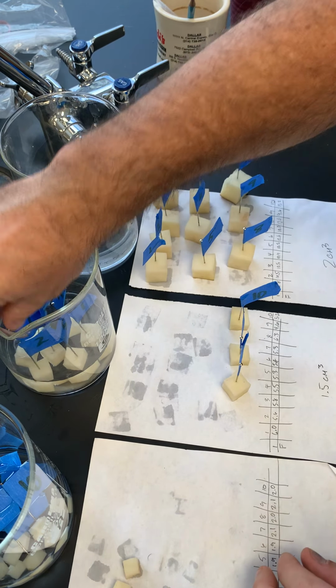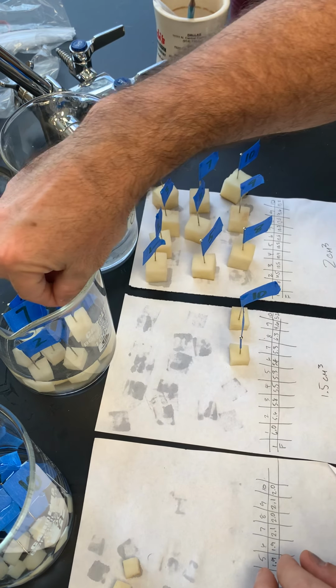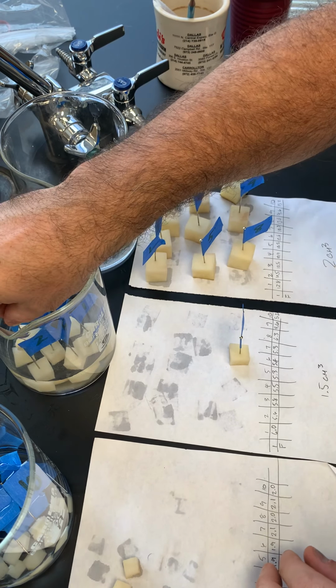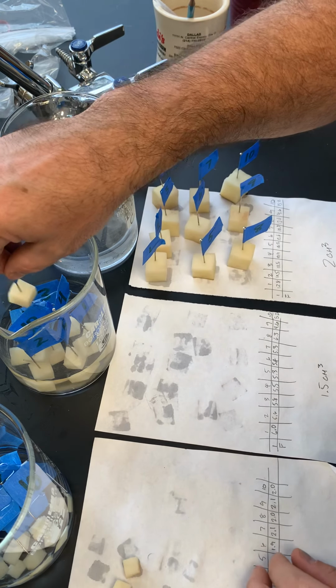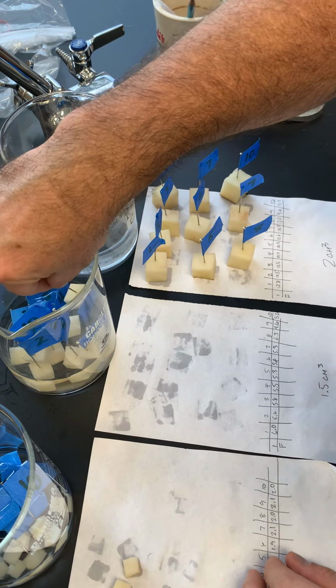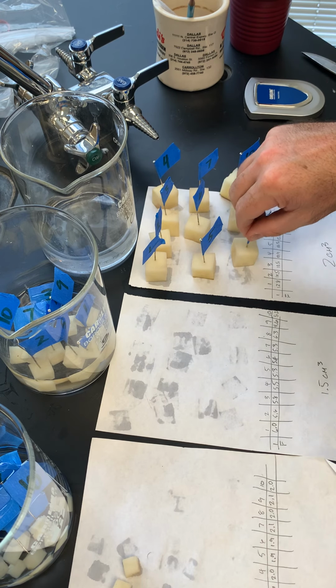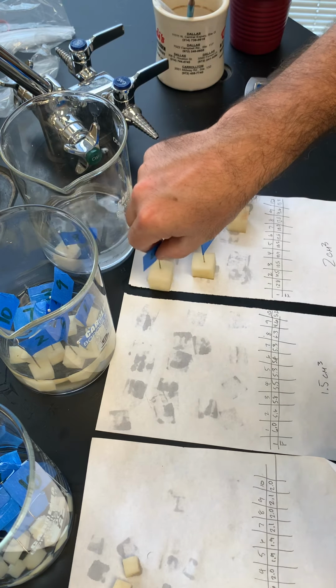That 2 centimeter group is going to be a booger. Ooh, came out. I'm gonna make sure they're all the way submerged. That may be a big problem for my next group. All right, so here we go for the other one. So get them all bunched in here.